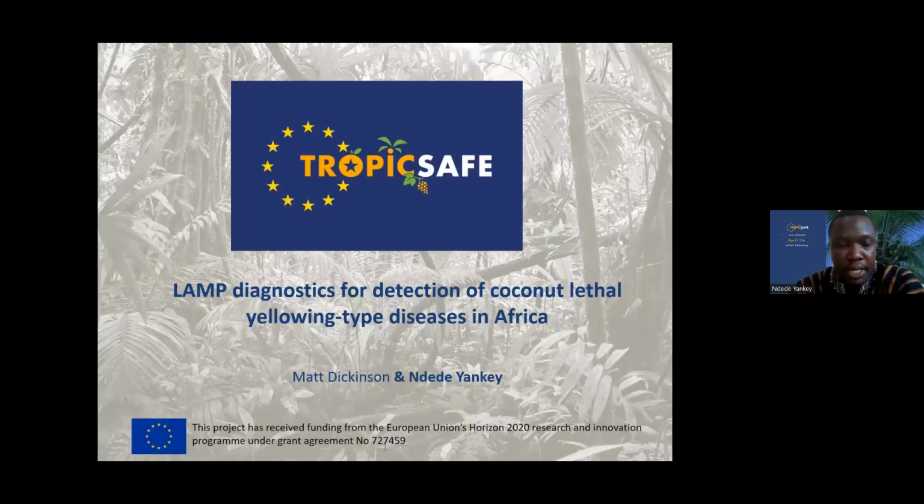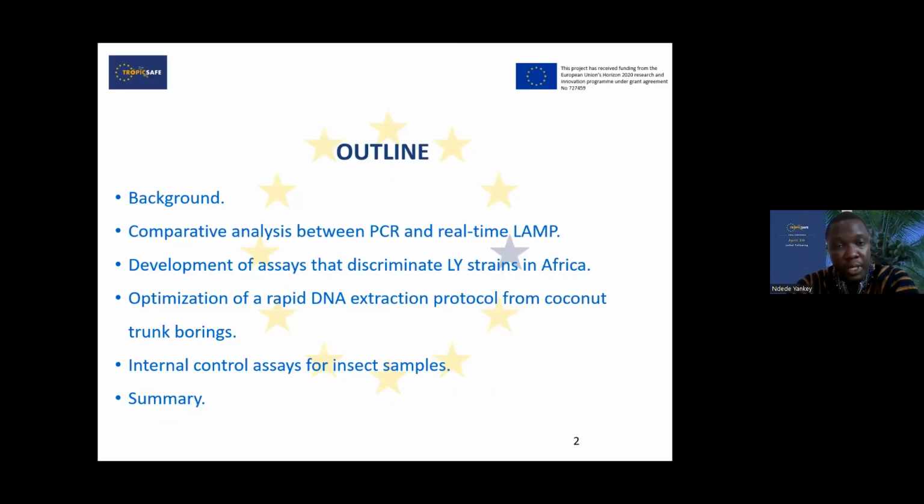Thank you very much. And so the topic is LAMP diagnostics for detection of coconut lethal yellowing type diseases in Africa. And I'm presenting on behalf of Professor Matthew Dickinson. So this will be the outline of the presentation.